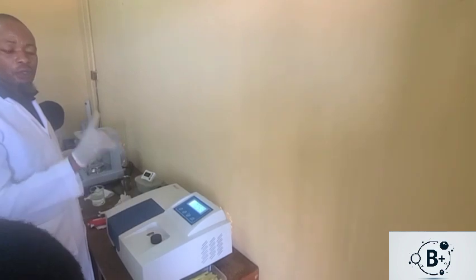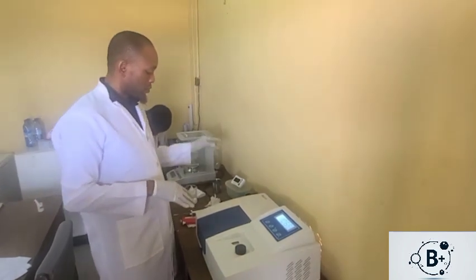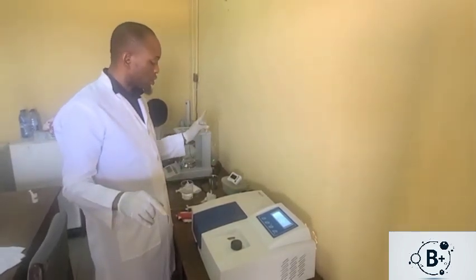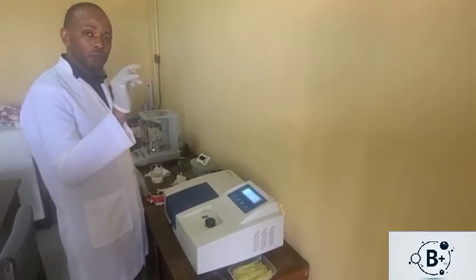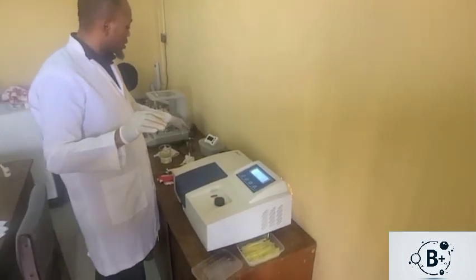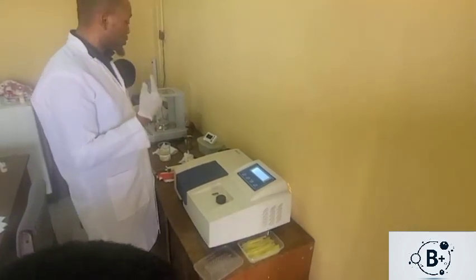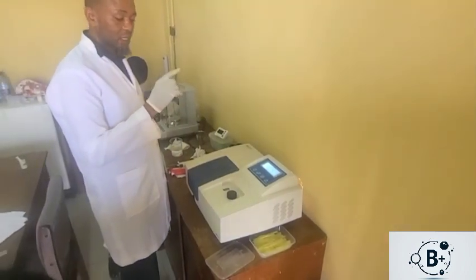But ensure that before starting it, we have to do the blank. For this one, we do the blank with an empty cuvette. Then we run the blank test. The blank test will be done using distilled water as the analyte instead of the sample. So we add all the reagents, then we use the distilled water. All of this depends on the protocol anyway, so your protocol may be different from mine. The protocol I'm having here, I'm using distilled water as the test sample.